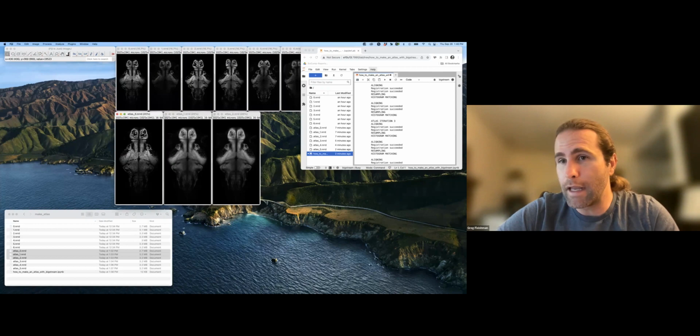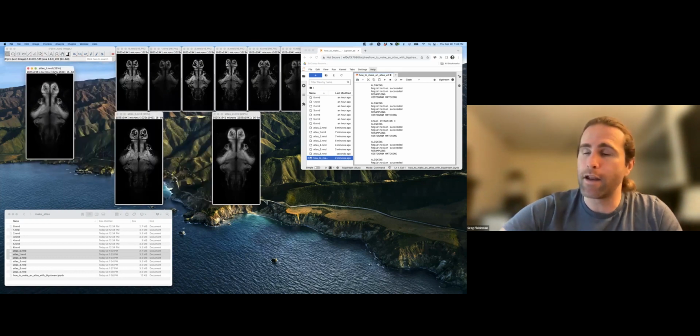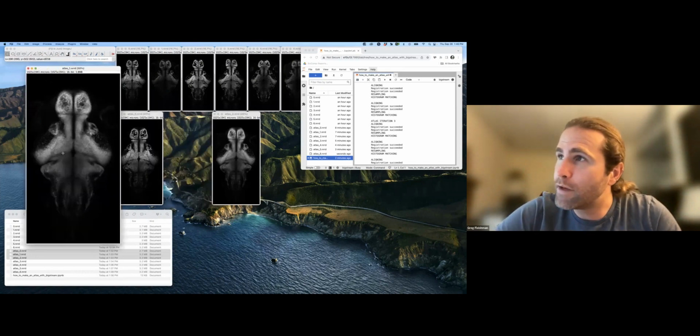Atlas 0 looks like an individual sample. You can see individual cells resolved clearly. Atlas 1 doesn't look like that. It's a little bit fuzzy. The reason it's a little bit fuzzy is because even if you have the large anatomical regions of the sample correctly registered, like the boundaries of cell body and neuropil regions, or glia and neuron regions, in this case only cell bodies of neurons, only nuclei of neurons are stained. So these dark regions, that's neuropil or glia, so there's no signal there.